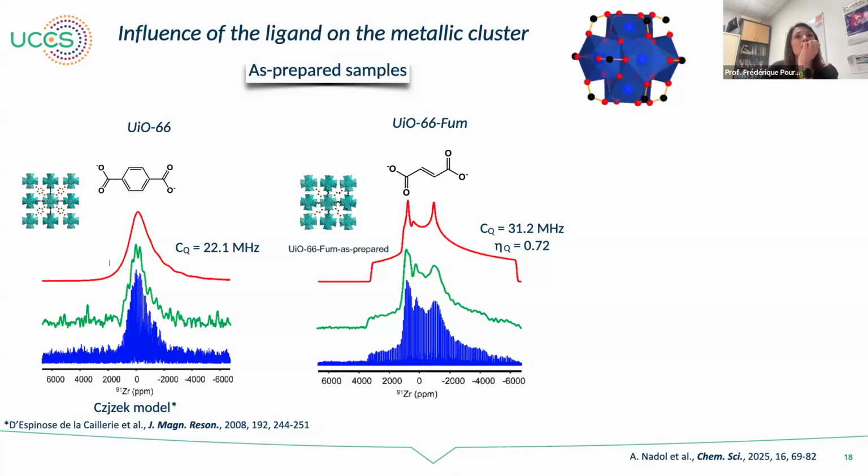Quantify. I don't know. It's an interesting question. Not with zirconium. With zirconium you can see it, but not quantitatively. Maybe with proton NMR, but not with zirconium NMR, I guess.